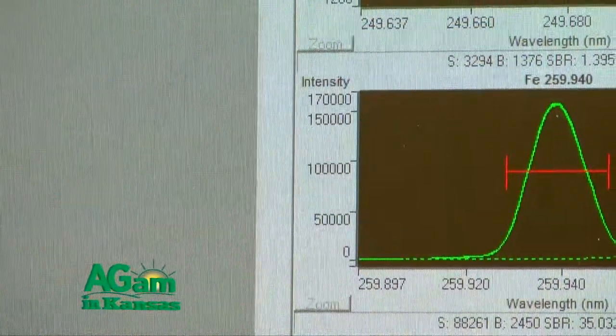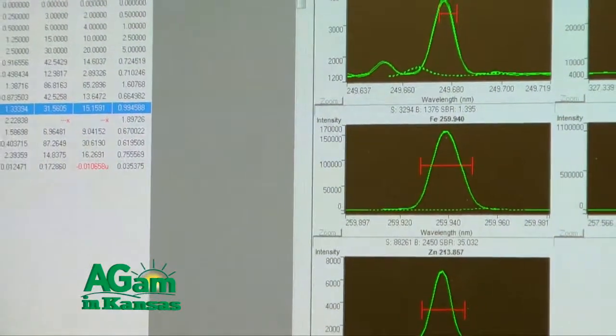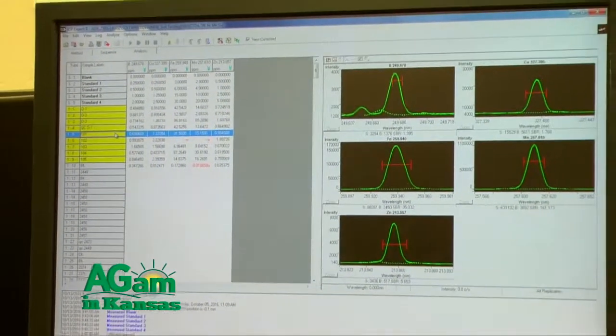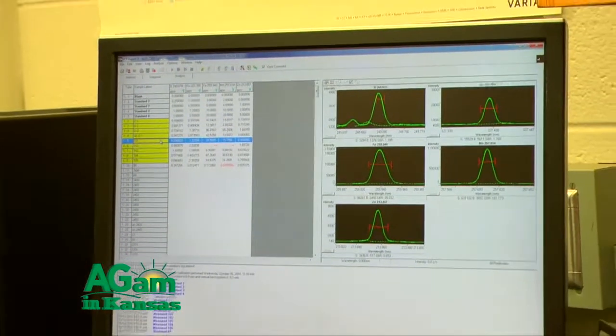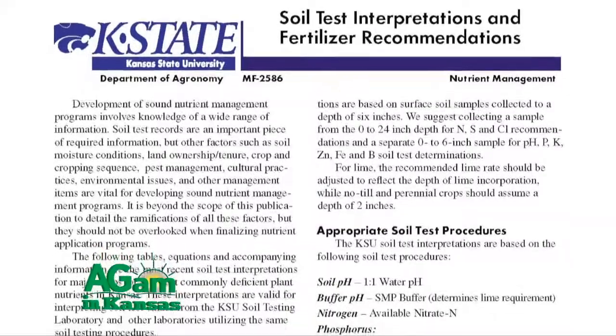Yes, Jim. The Soil Testing Lab really has a couple main missions, and one of them, of course, is to provide analytical service to farmers, extension, and homeowners, basically the test results for soils, tissue, and water samples. But the other aspect of the lab is also providing recommendations for producers in terms of what to do with those numbers, what kind of fertility program they should be doing based on those results.